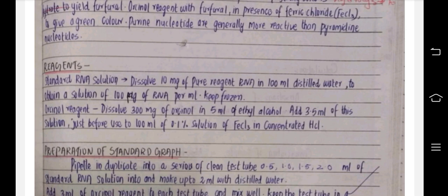Standard RNA solution: dissolve 10 mg of pure reagent RNA in 100 ml distilled water to obtain a solution of 100 μg of RNA per ml. Keep frozen. Orcinol reagent: dissolve 300 mg of Orcinol in 5 ml of ethyl alcohol.